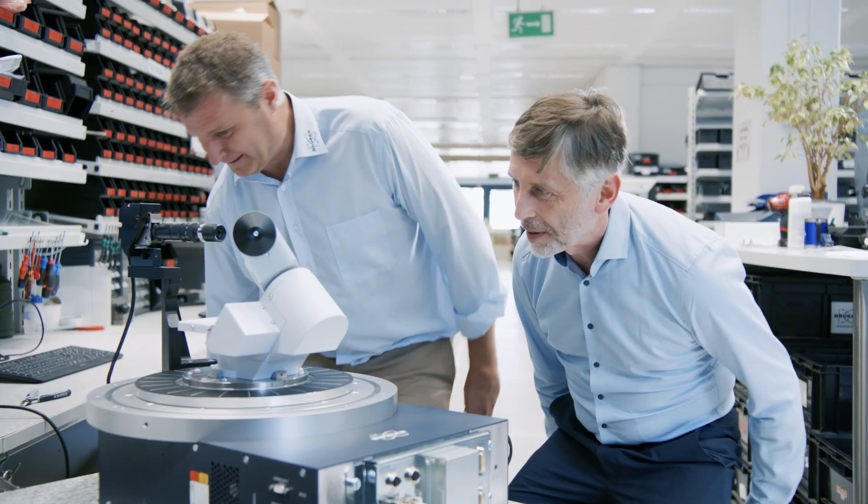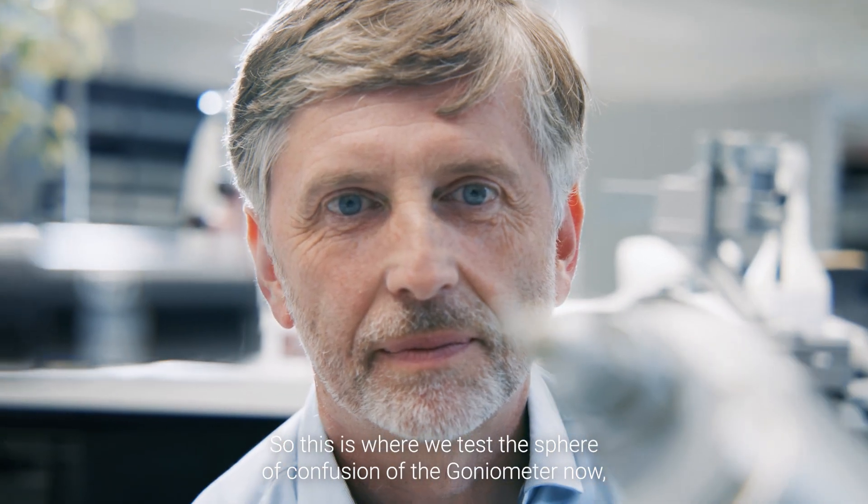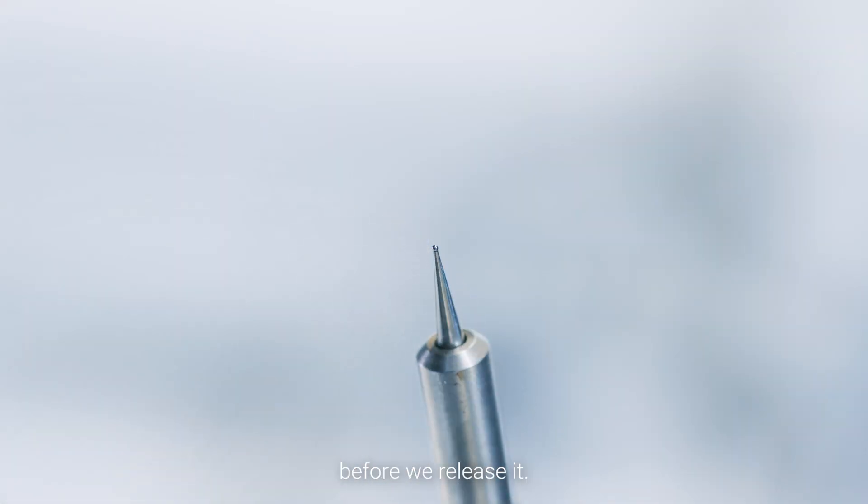Take a seat. Thank you. This is where we test the sphere of confusion of the goniometer to confirm that it's within the specified limits before we release it.